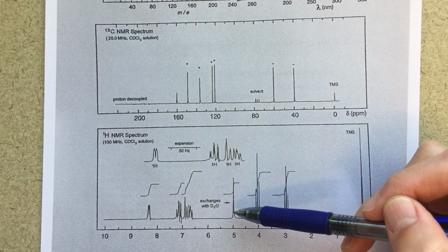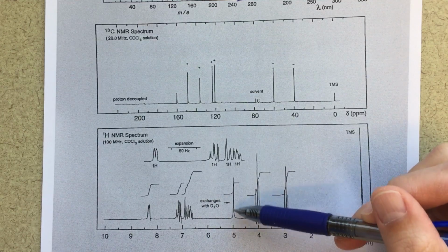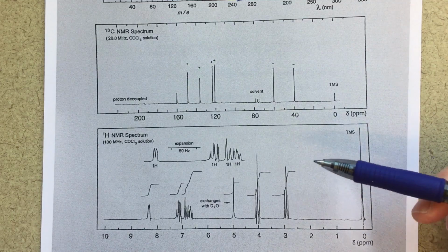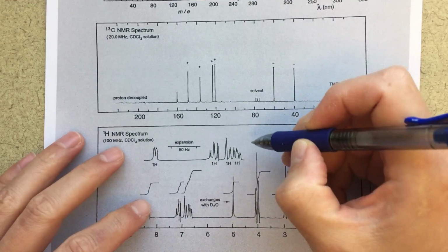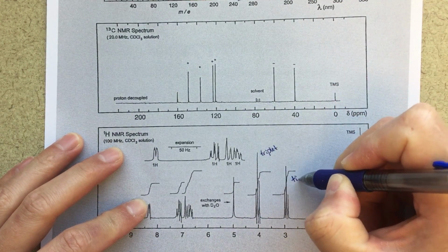And then I've got this peak here that says exchanges with D2O. It looks like it's a little bit broadened, and the fact that it's around 5 indicates to me that's our alcohol OH proton. And then I've got two triplets. So both of these are triplets.